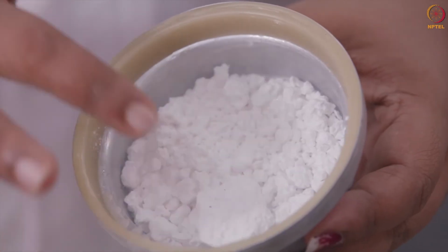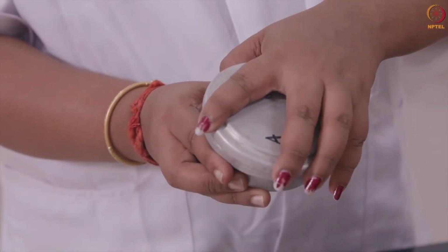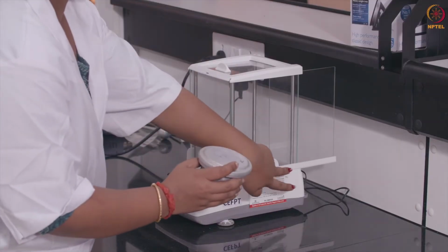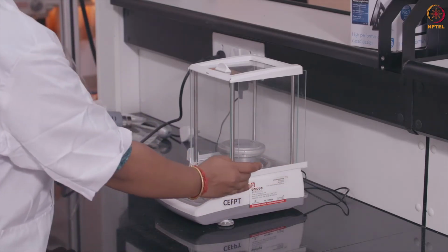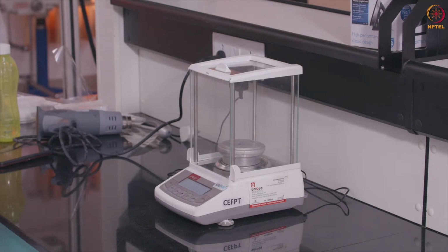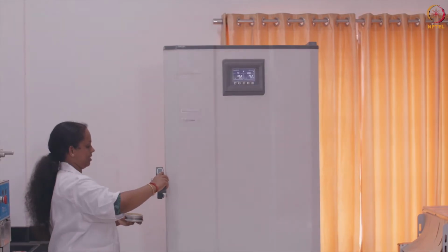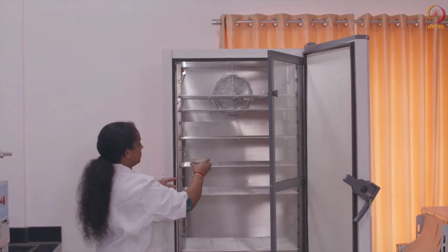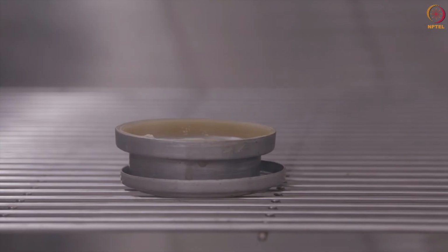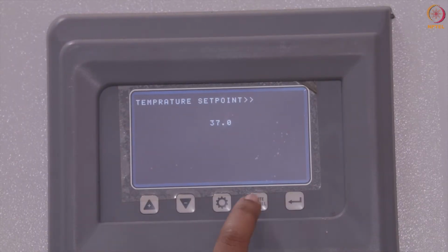This is the area of sample exposed to the atmosphere. Now take the initial weight. Next, place it in a conditioning chamber which is maintained at 37 degrees centigrade and 90% relative humidity. Note the increase in weight every day till you get constant weight. The increase in weight per 24 hours gives the WVTR of the material in grams per meter square per 24 hours.